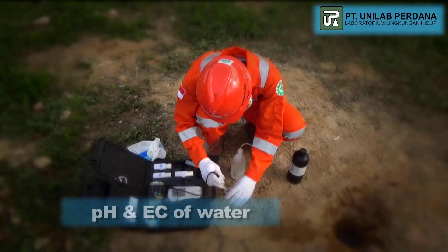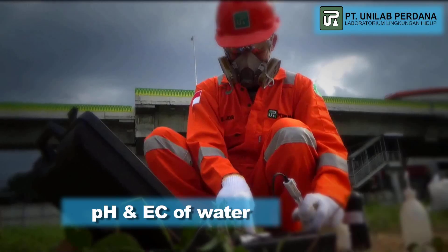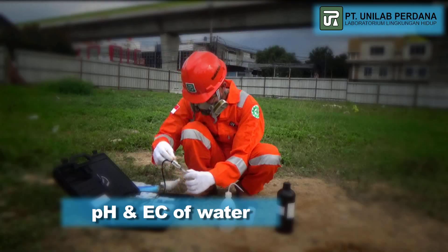pH is a measure of the hydrogen ion concentration of a solution. The method used to analyze this parameter is based on the measurement of potentiometric or electrometric hydrogen ion activity using a pH meter.